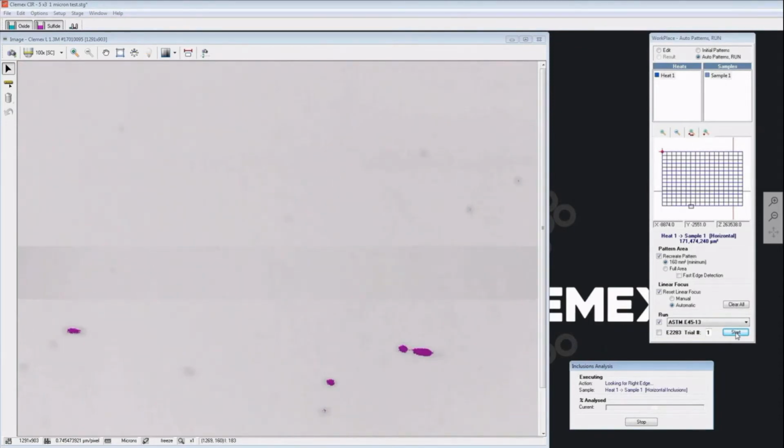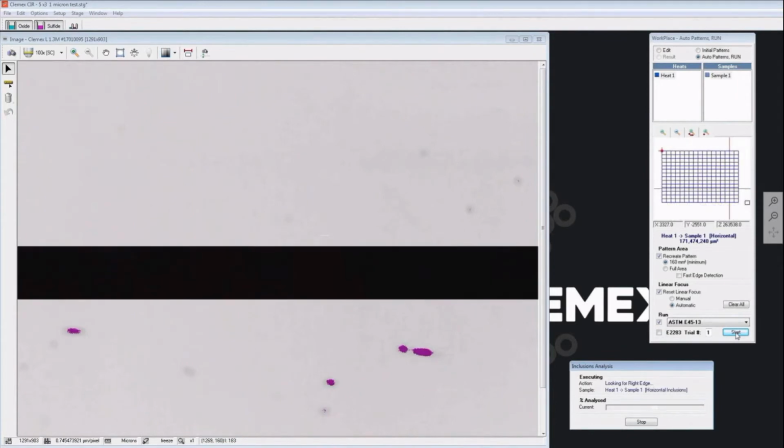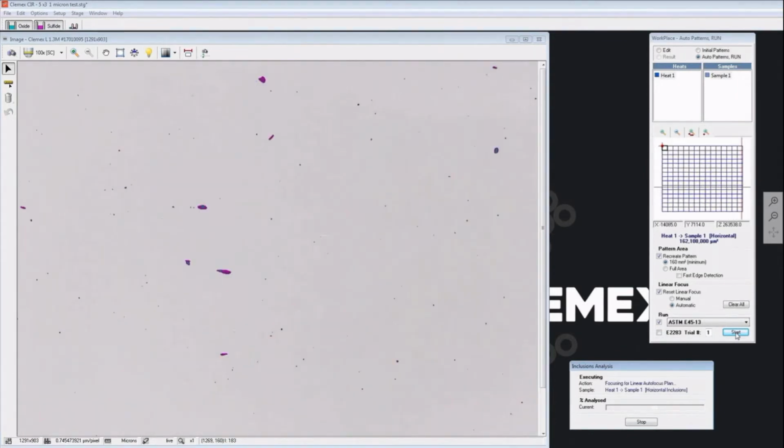You may wonder why here we have a small line that's moving and the rest of the image is frozen. This is because we're only detecting the edge right now, and we only need part of the image to be processed, which saves a lot of time on computer specifications. So now we're detecting the third edge and the fourth.